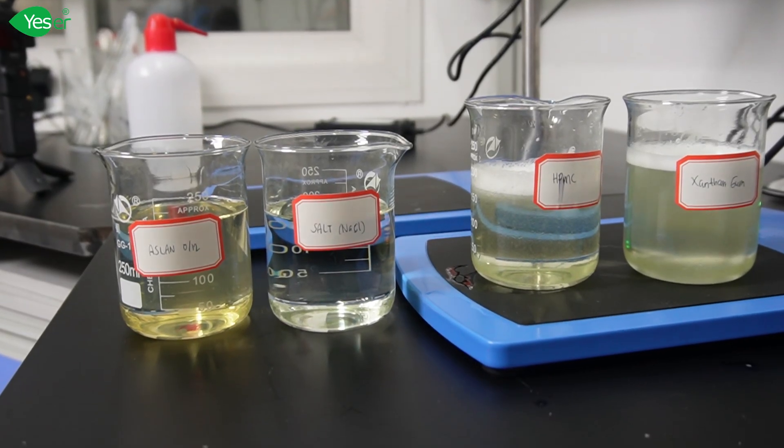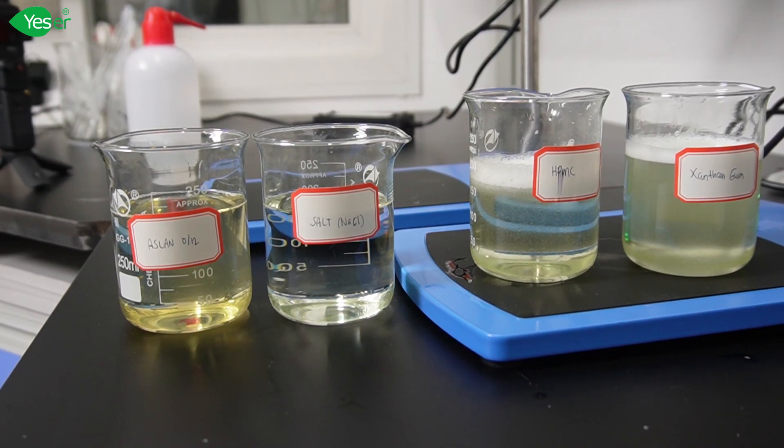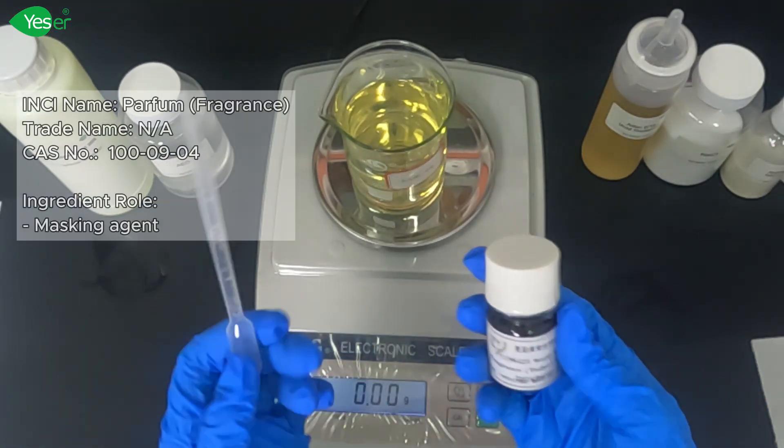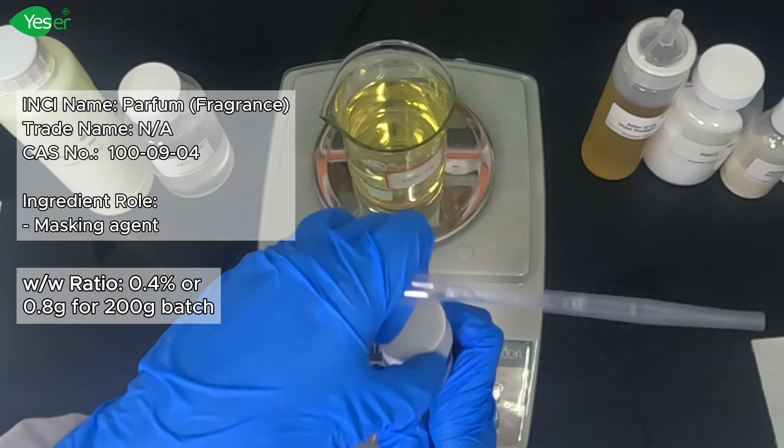Now that all our thickeners are fully dissolved in the formula, we will now add all of our additives, such as dye and fragrance. Let's add 0.8 grams of our fragrance, that would be 0.4% for our formula.